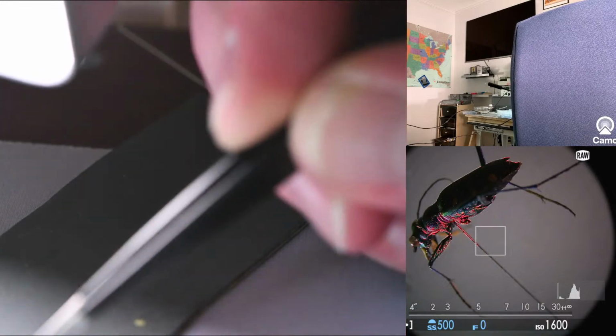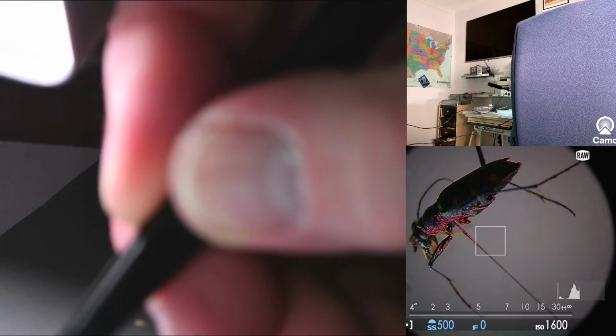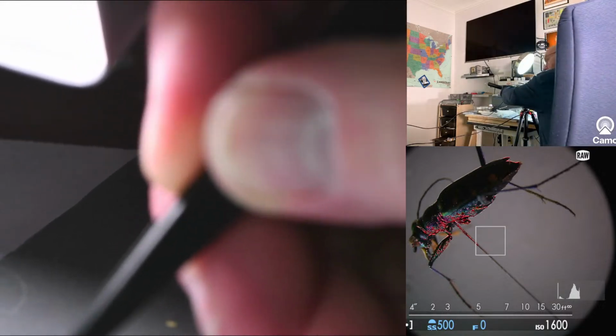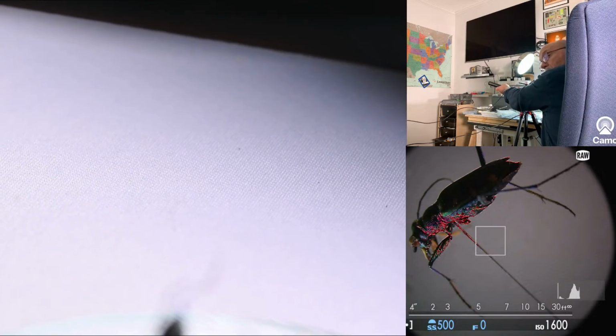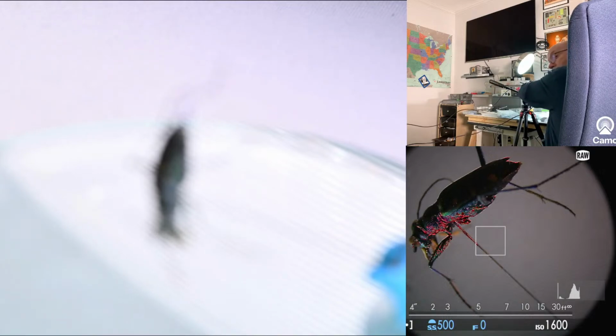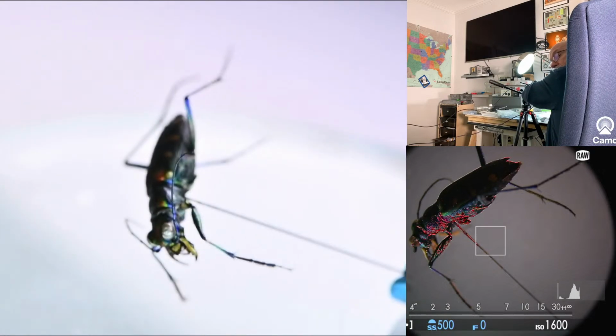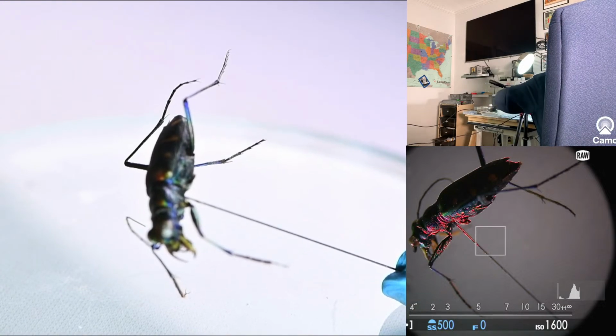In fact, I'm going to use the tweezers for the glue, just because. Bevel down into the glue. Alrighty, it's facing a little bit in the wrong direction. There we go. Now, let me line up the bug. I'm already risking running out of time here because of the necessity of getting this camera positioned. Because if you can't see, there's very little point doing it, is there? There we go. Alrighty. I hope you can see okay.